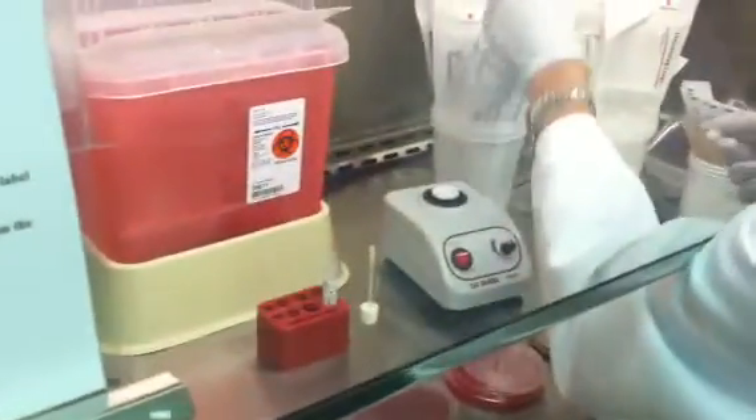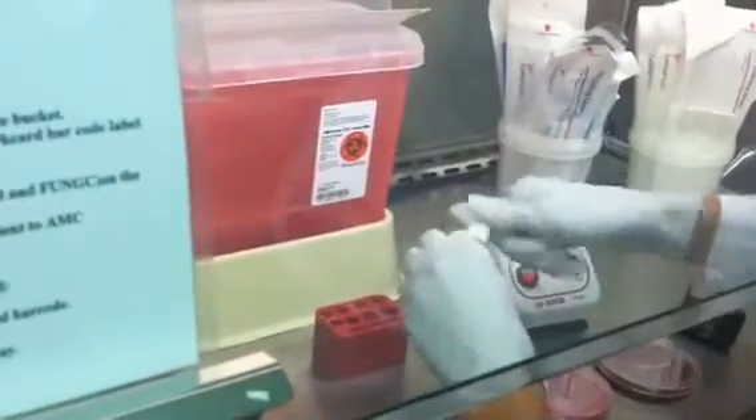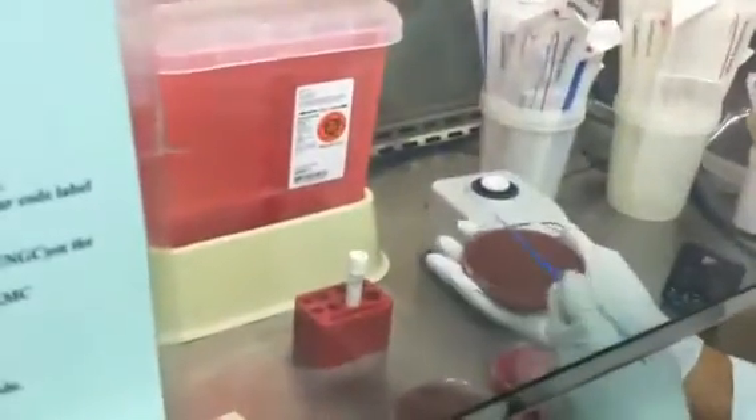You can throw the rest of it away. Make a gram stain, heat fix it, and close up your swab. Then you would just streak your plates like any other culture.